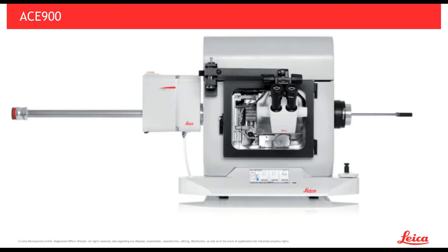I think I can answer that. This is Evan. One way of marking structures in freeze fracture, freeze etch is to do Immunogold labeling. This is a rather tricky technique to do. John Rash has some excellent papers describing the technique. Essentially, after the replica has been formed in the freeze fracture apparatus, you would digest away the tissue with something like SDS rather than bleach in an attempt to keep some of the membrane protein still attached to the replica.